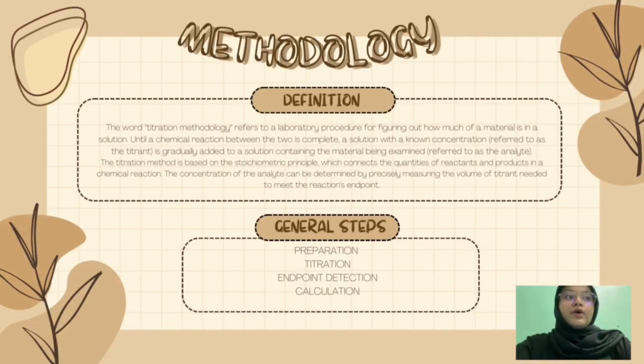Next, we will talk about methodology. What is methodology? The word titration methodology refers to a laboratory procedure for figuring out how much of a material is in a solution until a chemical reaction between the two is complete. A solution with a known concentration, referred to as the titrant, is gradually added to a solution containing the material being examined, referred to as analyte.